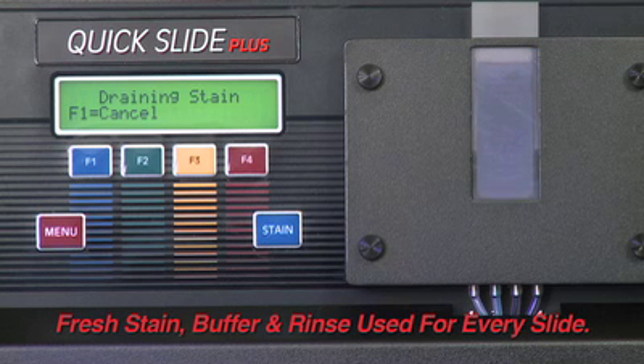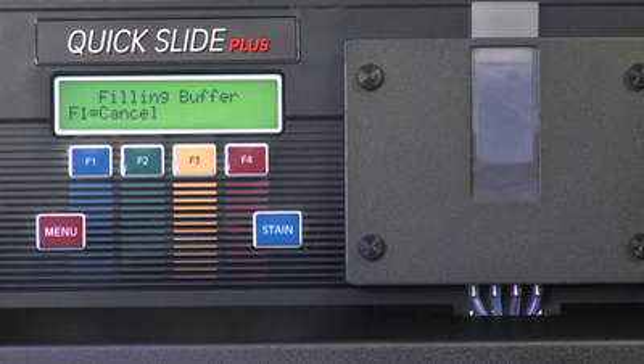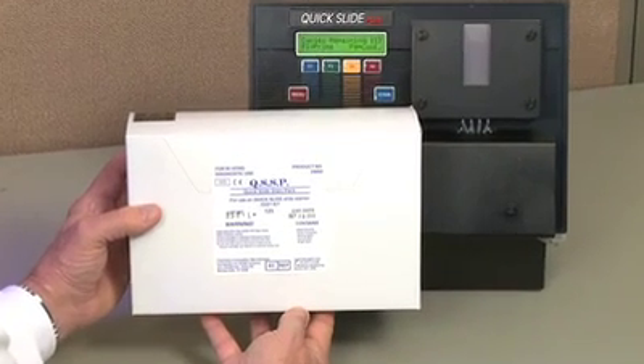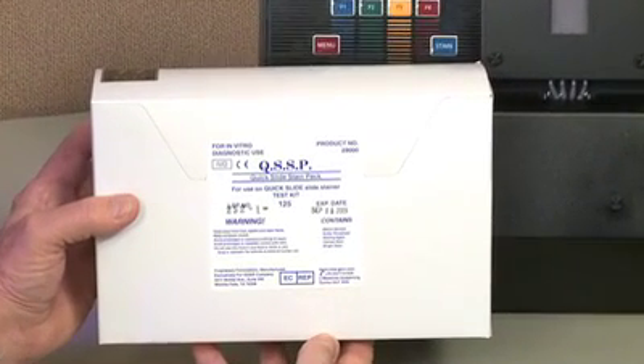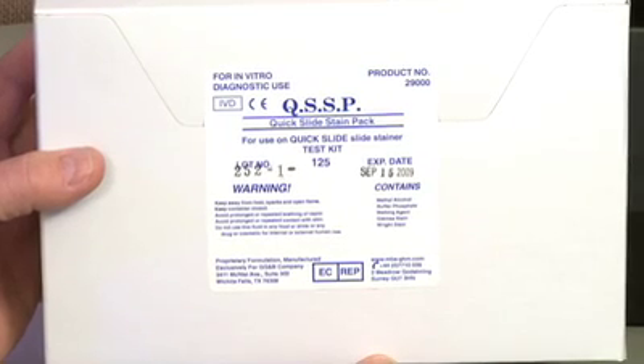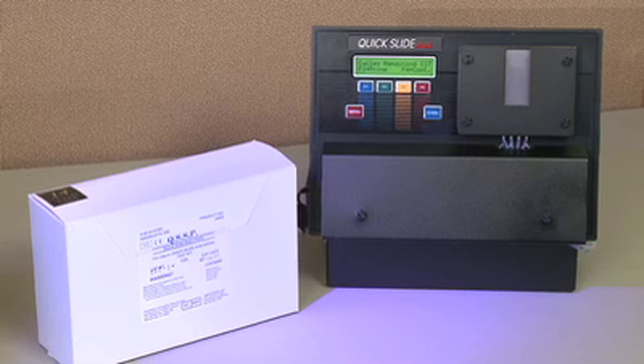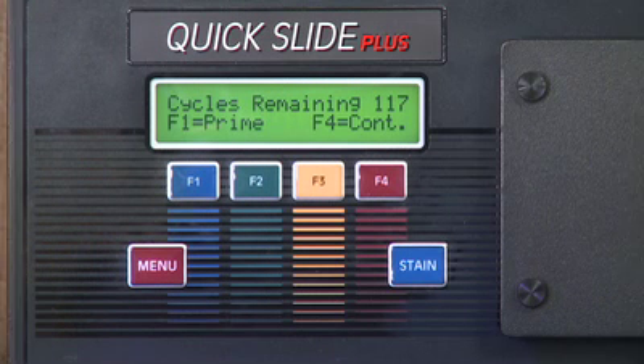Quick Slide Plus uses fresh stain, buffer, and rinse for every slide. Minimal maintenance is required with no more stain spills. Specially formulated reagents of modified Rite-Giemza, phosphate buffer, and DI water rinse with a 10% blend of methanol alcohol are provided in each stain kit, which does 125 slides. The LCD display shows how many cycles are remaining in the stain kit after each use.